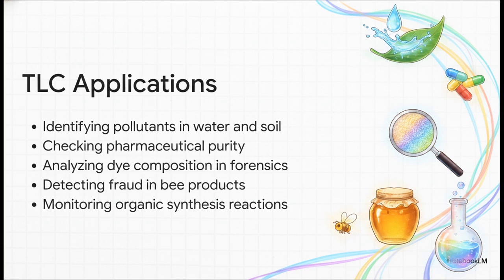Forensic scientists swear by it to analyze the exact dye composition of microscopic fibers found at crime scenes. Food scientists even use TLC to sniff out adulterated honey and bee products. And of course, organic chemists use it constantly to monitor the real-time progress of really complex synthetic reactions. It's a true frontline tool for safety, discovery, and justice.